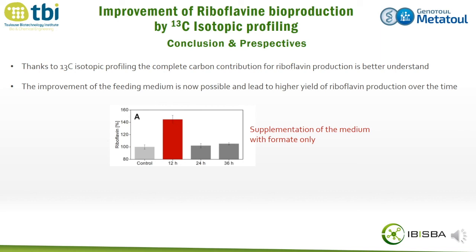To summarize, thanks to C13 isotopic profiling, we can describe the complete carbon contribution for riboflavin production. And we will now be able to propose an improvement of the feeding medium in order to increase the production yield of riboflavin.